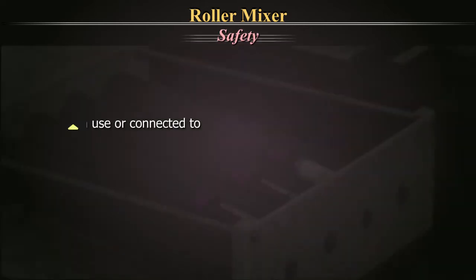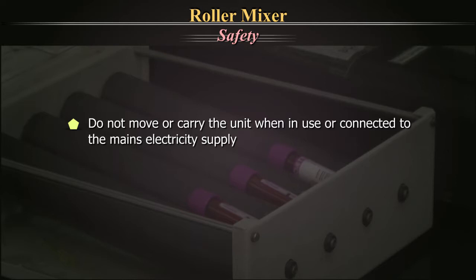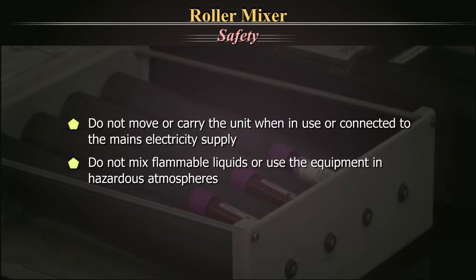Safety: Do not move or carry the unit when in use or connected to the mains. Do not mix flammable liquid or use the equipment in hazardous atmospheres.